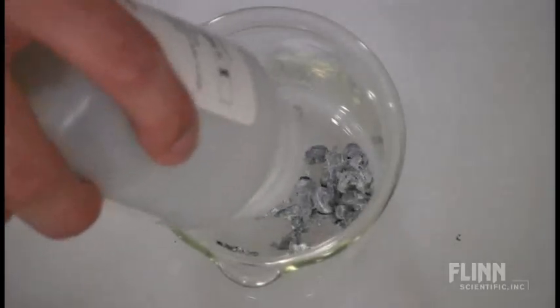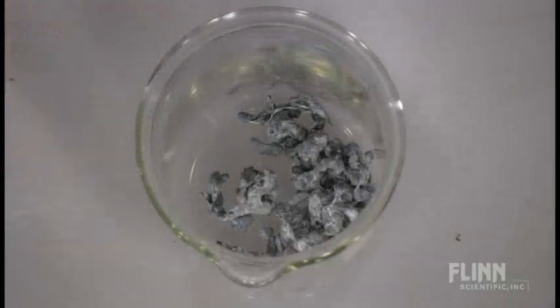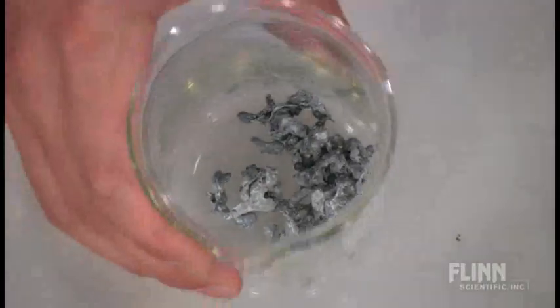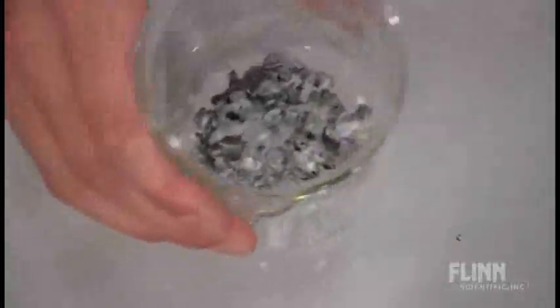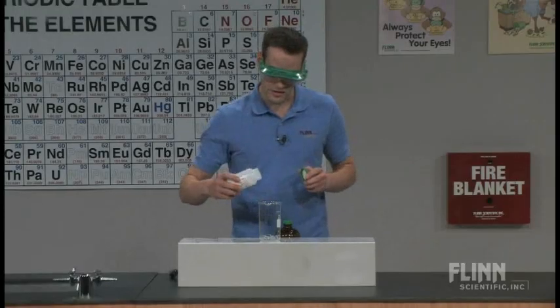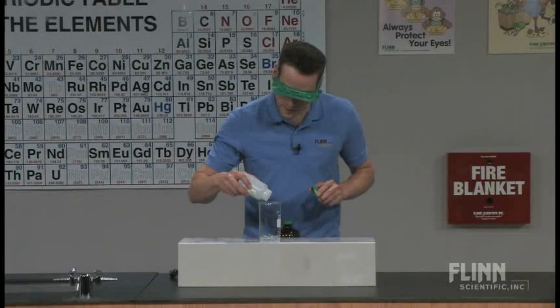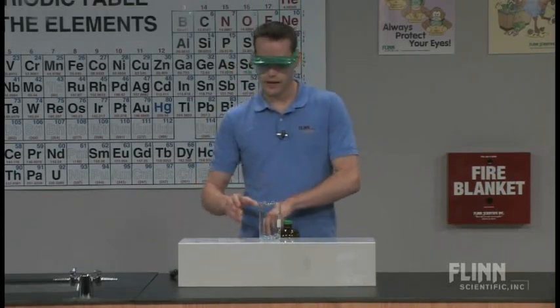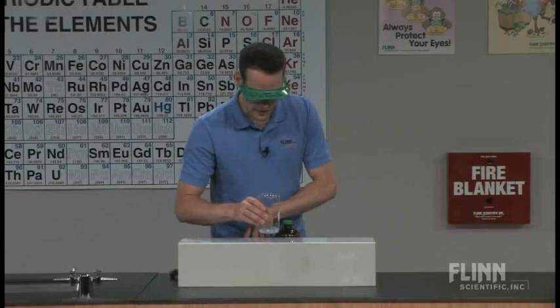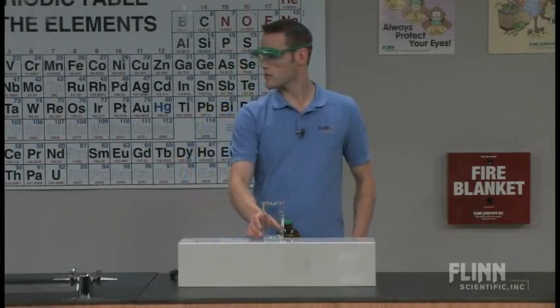Most of the directions usually say to measure this out with a balance. I usually pour directly from the zinc and just make sure that I get a good coating on the bottom of the beaker. So you just want a nice thin layer of zinc on the bottom and add just a few more pieces. And once you have a nice coating, then just pour the tin(II) chloride solution over top.